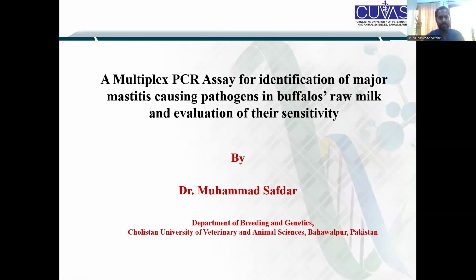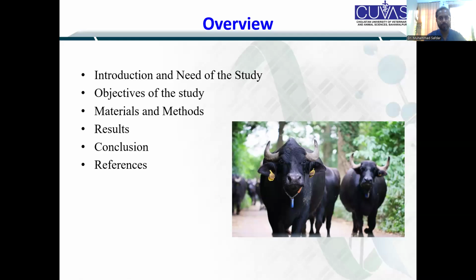My topic today is a multiplex PCR assay for identification of major mastitis causing pathogens in buffalo raw milk and the evaluation of its sensitivity. My name is Dr. Mohammed Safdar. I am a lecturer in the Department of Breeding and Genetics at Cholistan University of Bahawalpur.